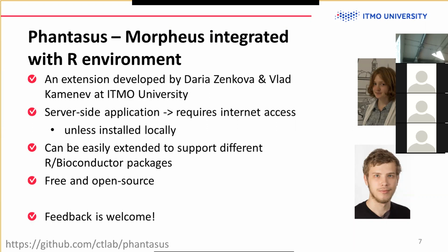Today and tomorrow we'll be working a lot with this, and later in the modules we'll be working a lot with this tool. But one thing: it's a server-side application, so your data is sent to the server. If you work with some very private data sets, be aware and probably install it on your laptop.